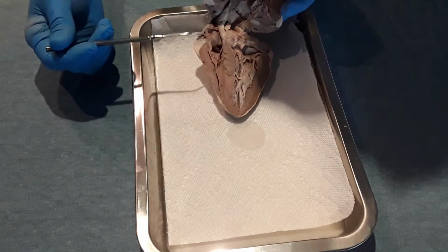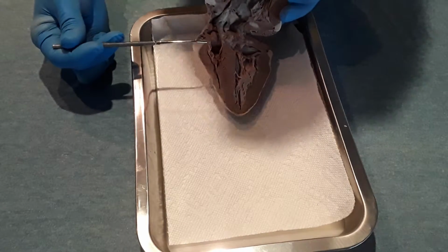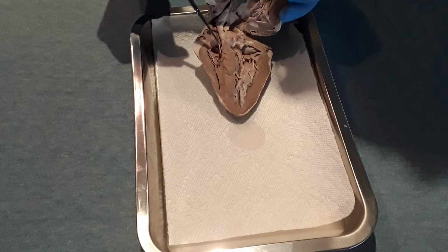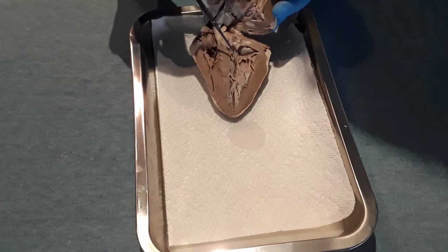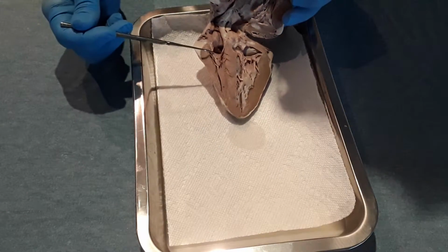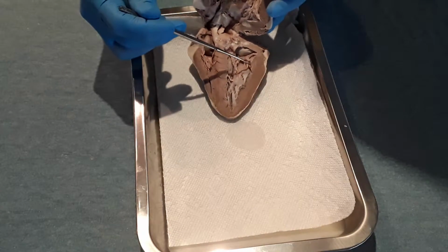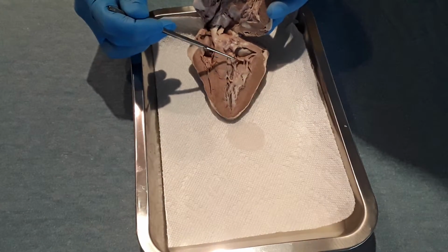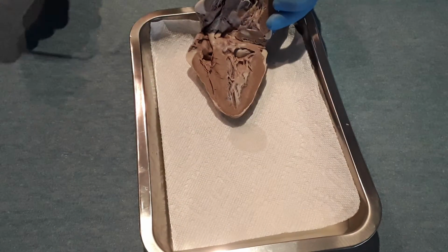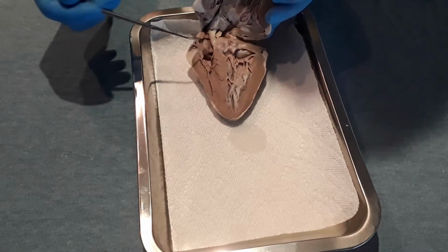You see some of the tendons attached to these valves, the chordae tendineae, these little thin string-like structures on either side of the valve leaflets. And then the muscles that pull on these are little small structures, a little bump here, a little small one here. You can kind of see this one on the inside. They're the papillary muscles that pull on the tendons to hold the valves closed.